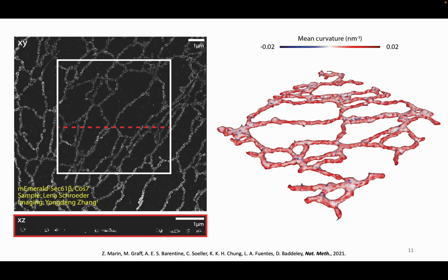In fact, everything in this reconstruction is a little bit of an over-approximation because when you cut a surface where the density goes from low to high, you're actually putting the surface a little bit outside of the actual locations of the points. This is published in our PYME Visualize open source software package, which is designed for interacting with, visualizing, and quantifying SMLM datasets. And you can look up the publication using the citation on the bottom of this slide.